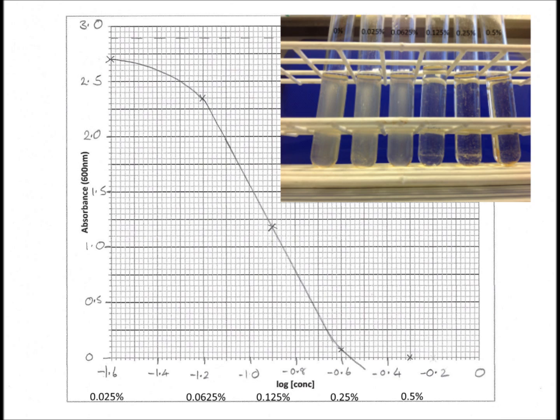We can use our graph to work out the minimum bacteriostatic concentration because that's the point where if you extend the line it will cross the x-axis. On my graph it crosses at log to the base 10 of minus 0.56, that's equivalent to a concentration of 0.275%. So the minimum bacteriostatic concentration of Chloros for E. coli in my experiment is 0.275%.